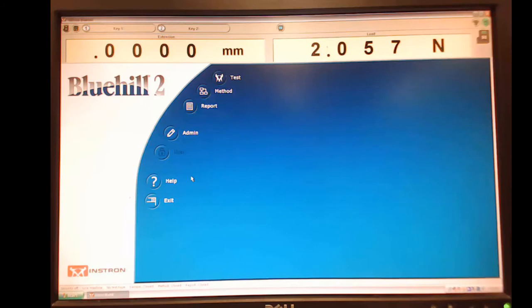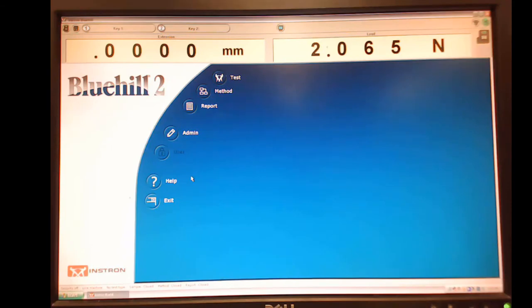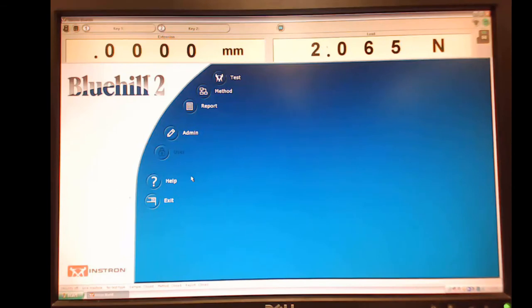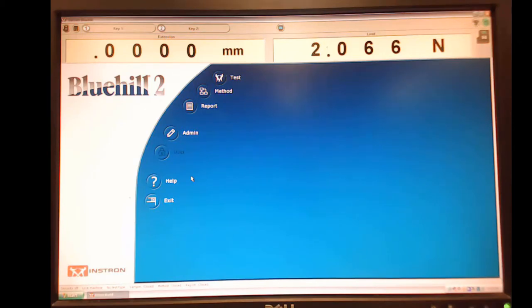And that's a good thing too, because the cross-section of the bone is not consistent. It's a little bit changing. So we're making some assumptions here that might not exactly apply, but we're going to do our best. And we're going to try to go ahead and compare the chicken bone versus some other materials I have out for us.